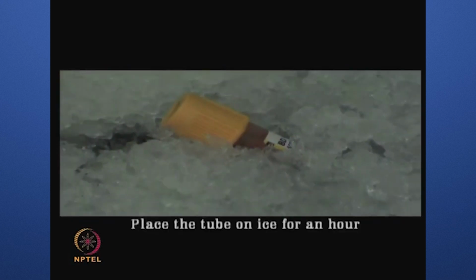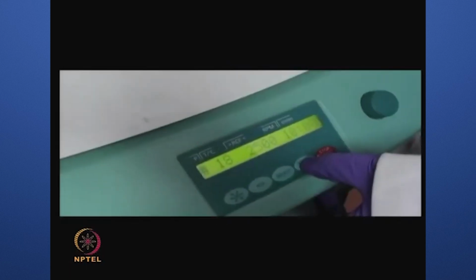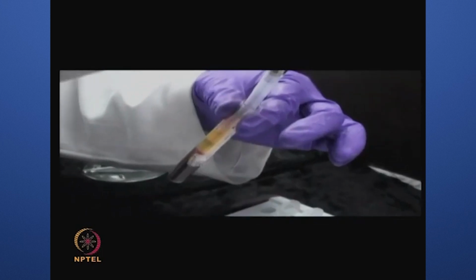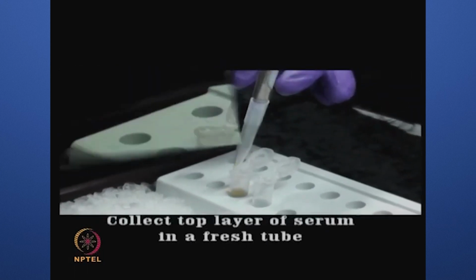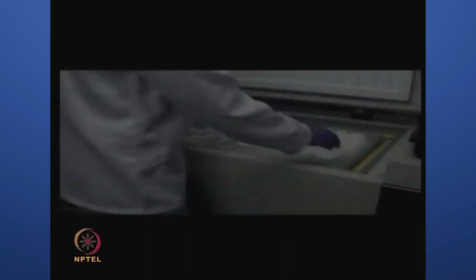Place the tube on ice for an hour immediately after collection to allow the blood to coagulate. Centrifuge the tube for 10 minutes at 2500 rpm to separate the coagulated blood. The blood cells, along with the clotting factors, form the pellet, while the serum containing proteins of interest forms a clear supernatant. Transfer the supernatant containing serum into fresh tubes. These can be stored at -80 degrees Celsius until required for further use.